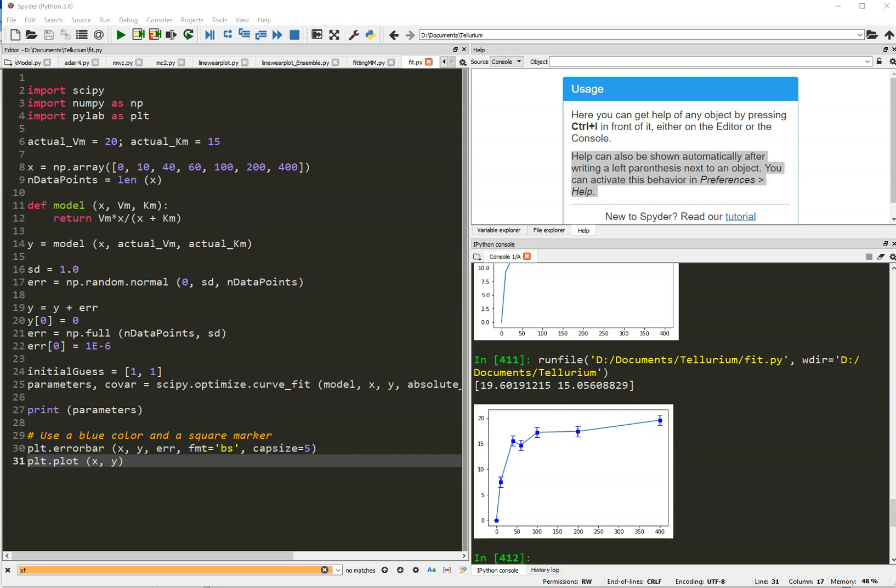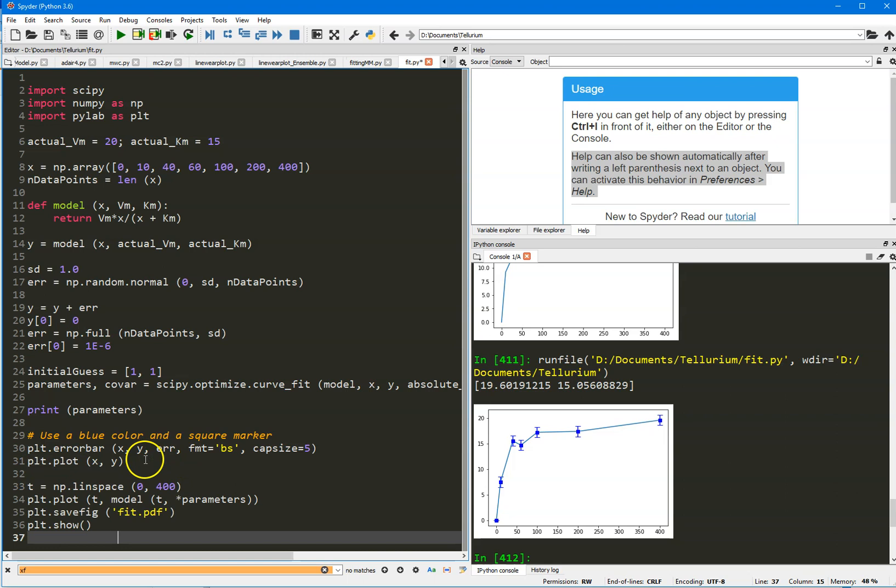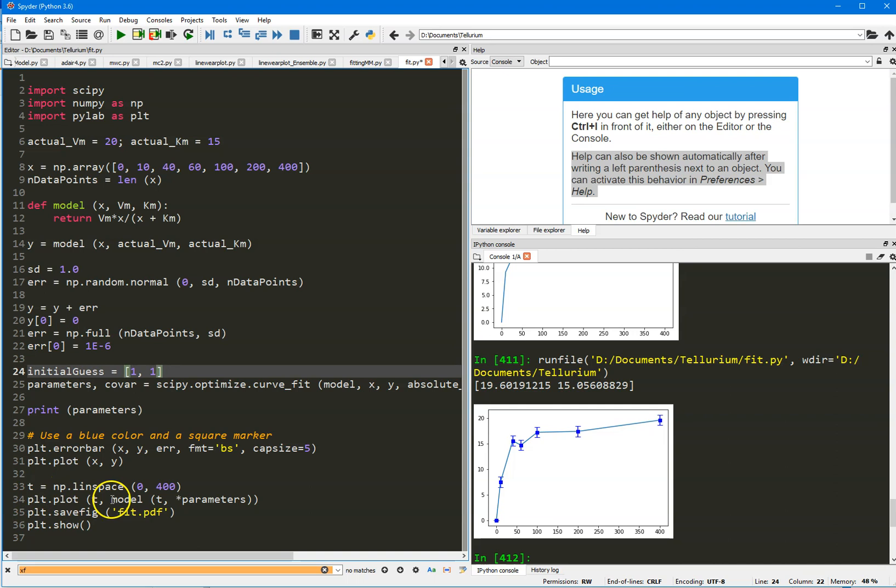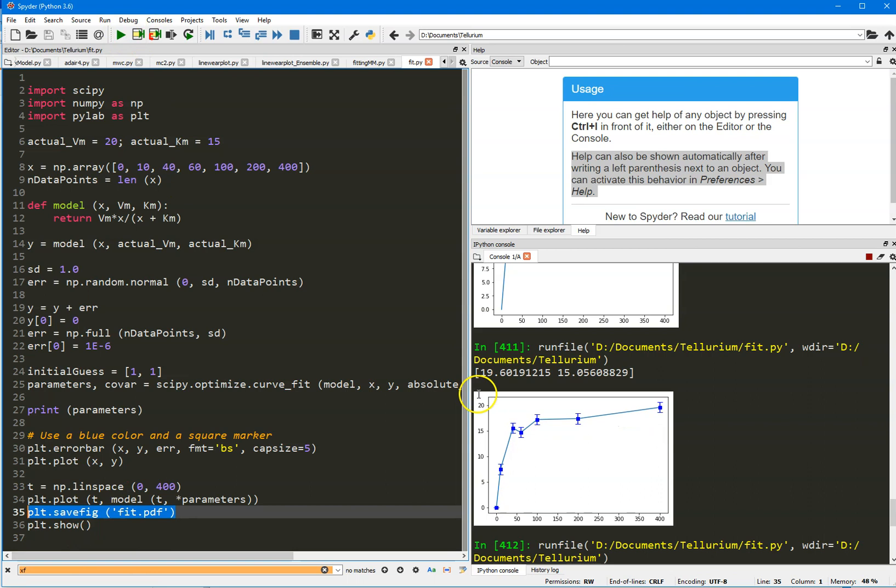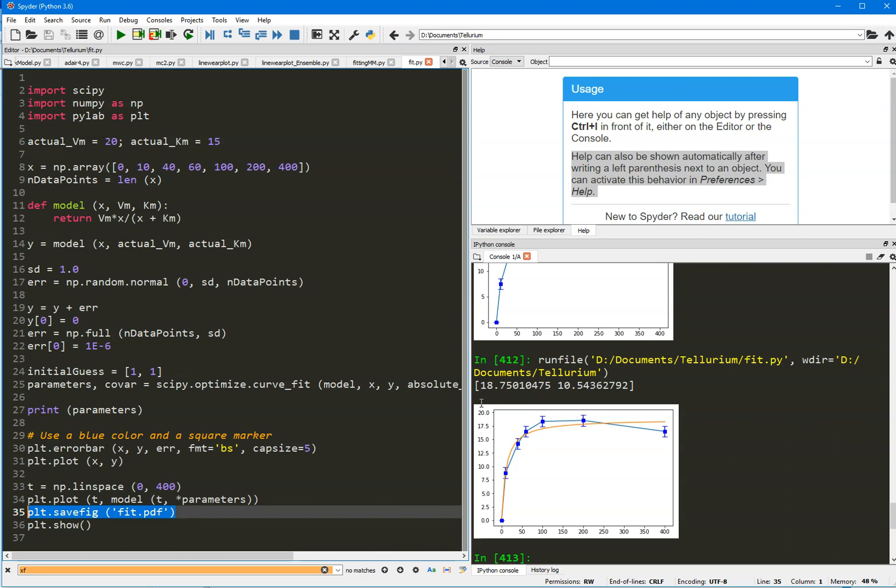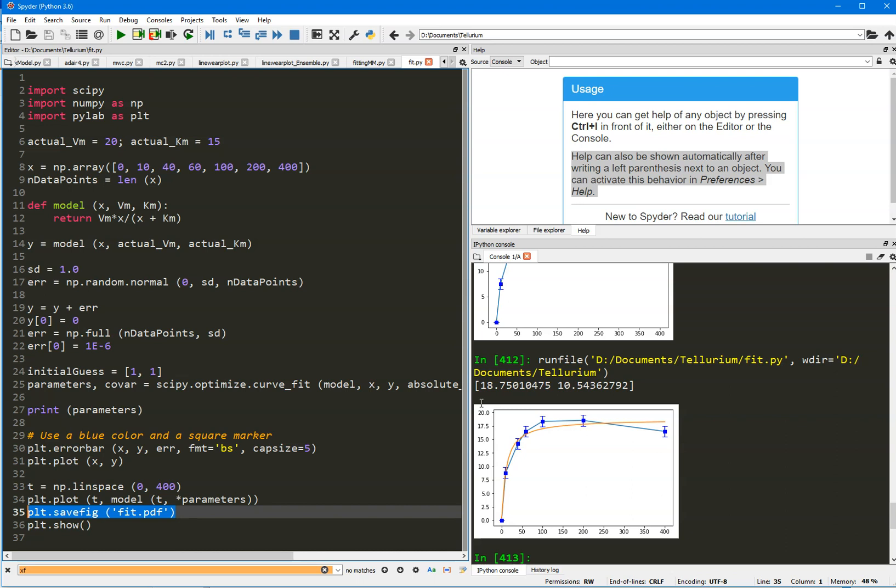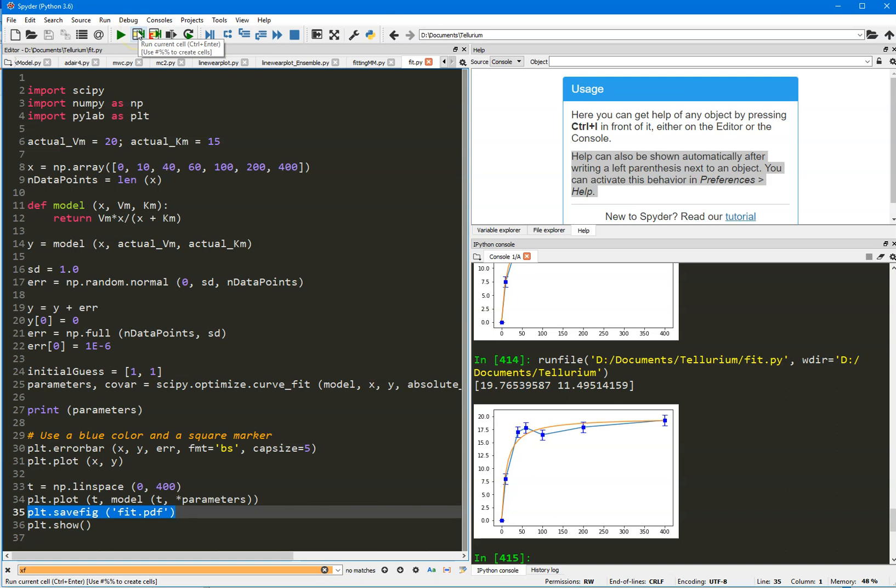Now, the other thing I can do is try to plot the fitted line on top of this. And that's what I'm going to do next. So, this code, it generates an X coordinate from 0 to 400. The 400 corresponds to the maximum value of the substrate concentration. Then, I'm going to plot T versus the model computed at T with parameters given by parameters. And then, just to show you that I can save this as a PDF if I needed later for a paper or whatever, then I'm going to show it. So, let's run this to see what it looks like. There you go. So, the orange is the fitted line. And if I run it again, it'll be slightly different. So, this is now my fitted line and my fitted parameters.